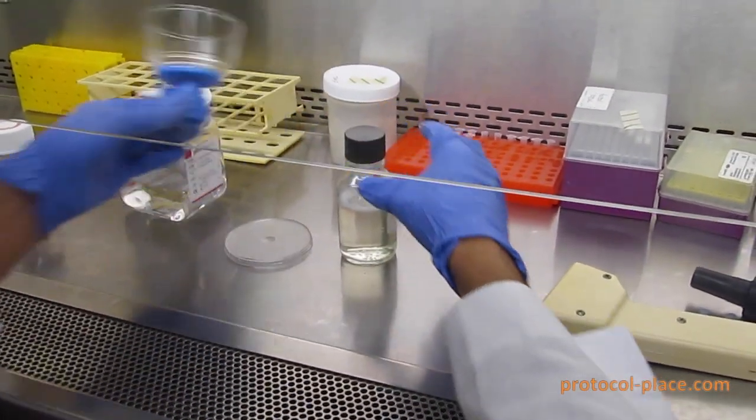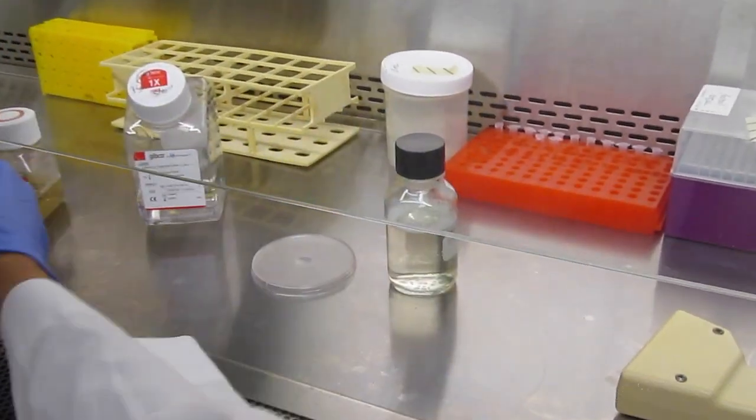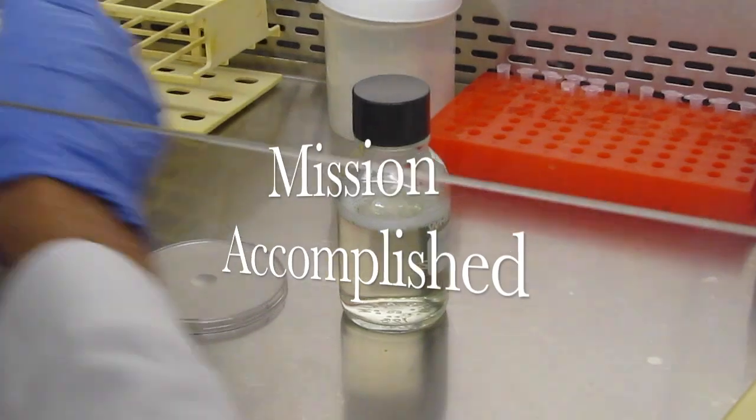After you're done, remove the filter and replace the lid on the bottle. And with that you've finished sterile filtering your solution.